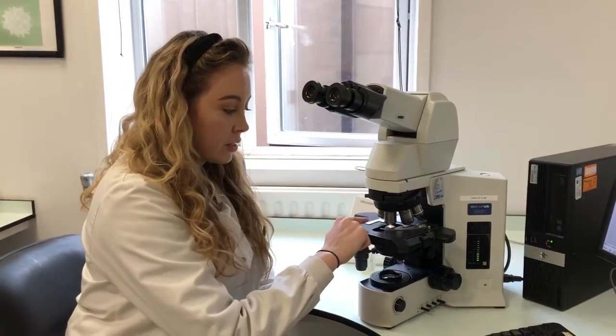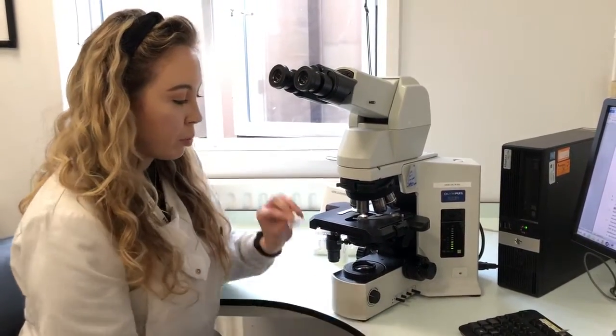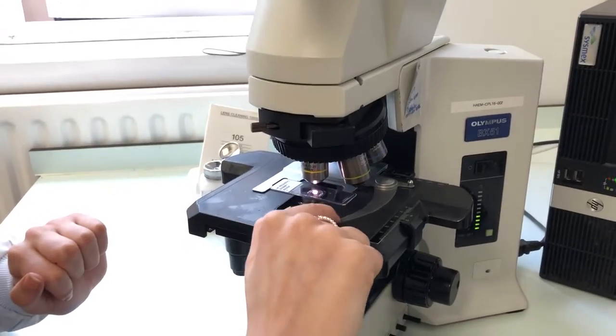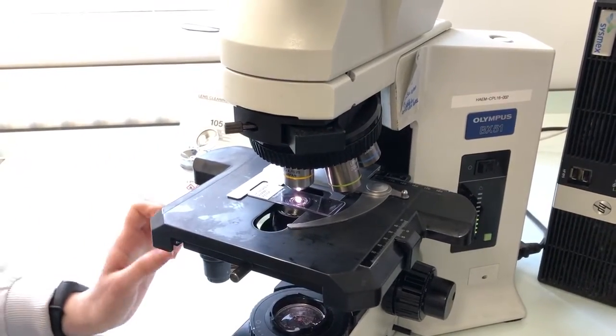Here is the stage. The stage is what holds the film. So if we place a blood film down, the stage holds it. This here is the clip that holds the film into place.